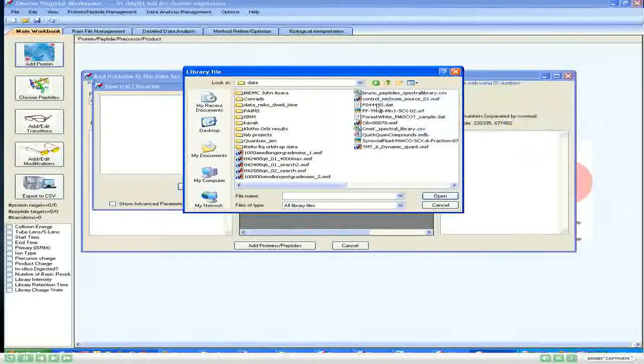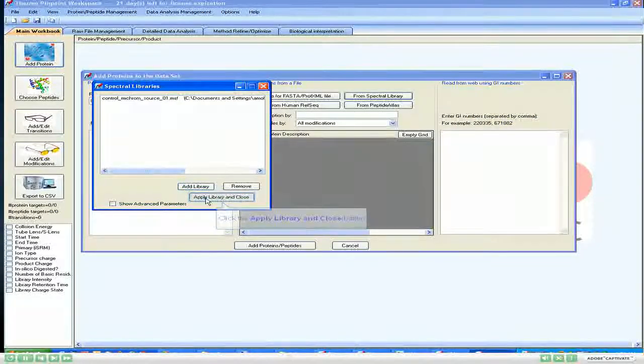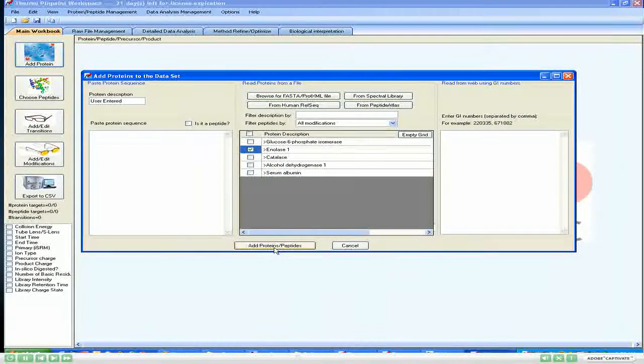And similarly at 25.04. So we can prioritize our transitions into primaries and secondaries, and then monitor only primaries and trigger secondaries as and when required.